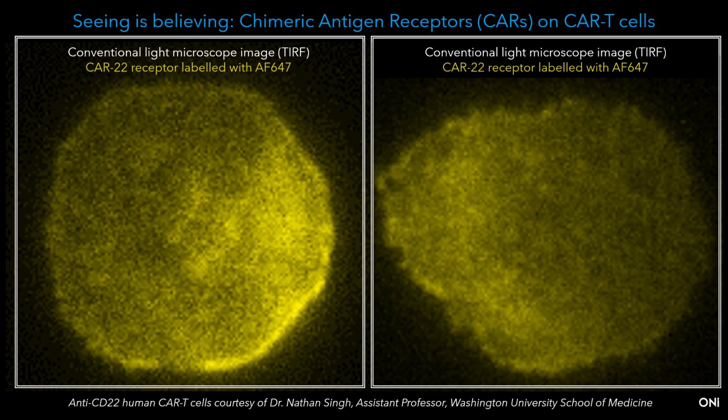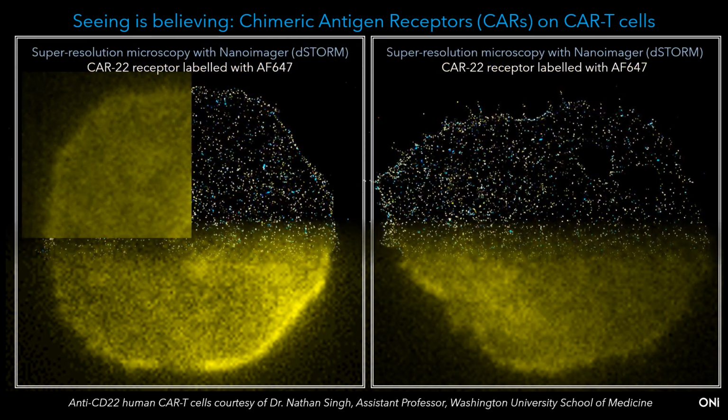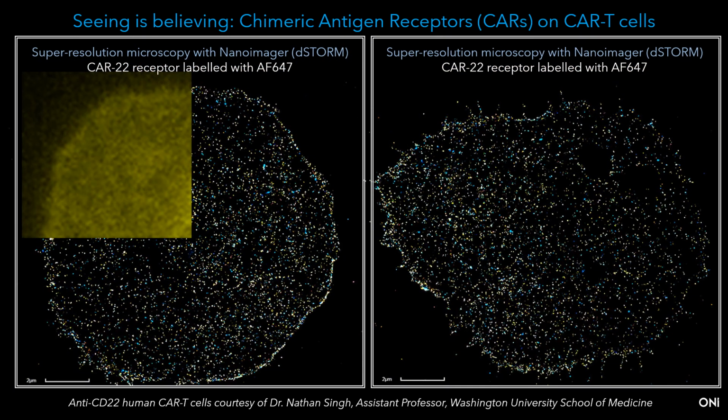Super-resolution microscopy refers to the constellation of imaging modalities that have allowed us to overcome these constraints really only recently, in the last decade. And in this brief talk, I'll show you how ONI has helped us strip away all of the pain points and the fussy fuss of super-resolution microscopy and microscopy in general with our instruments, our sample workflows, and our analysis tools.